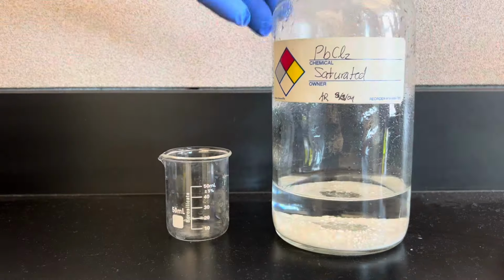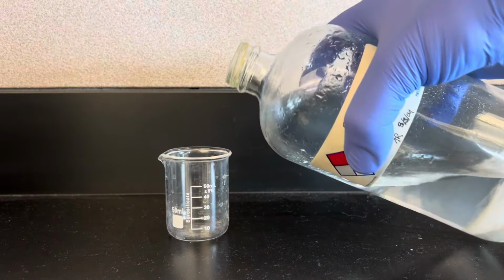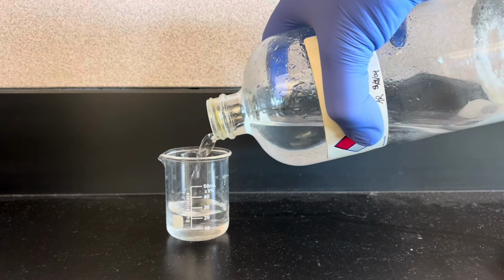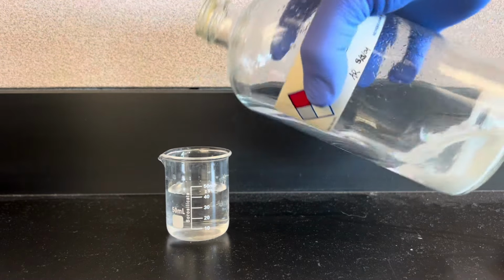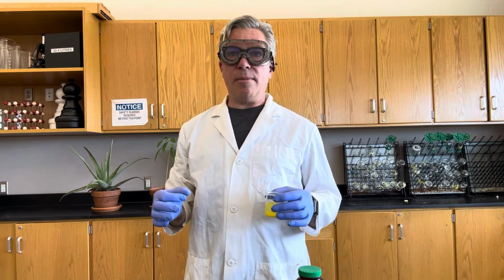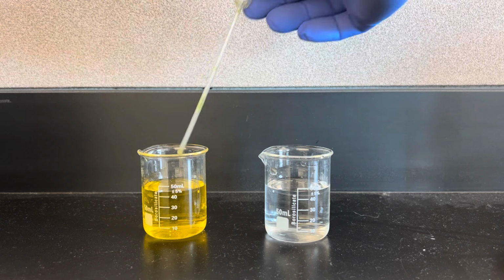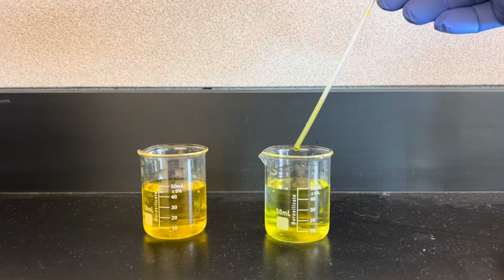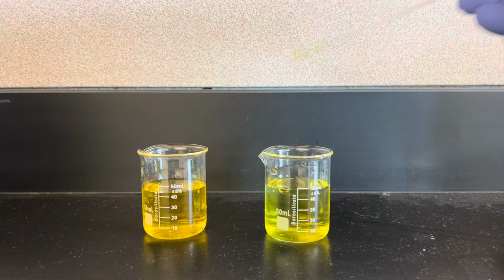And here I'll take some of the supernatant liquid that sits above the lead chloride in that bottle and put that into another beaker. And here's what it looks like when I take some of that dissolved potassium chromate and add it to another beaker of distilled water. Basically, I'm just making a more dilute solution of potassium chromate.